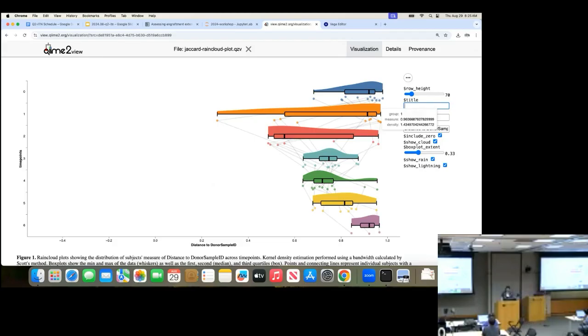Typing wasn't working for me. Okay, so maybe you want to call it like community engraftment extent using Jaccard distance. I don't know, anything you want. I could call this like figure 1 if that was helpful to me.